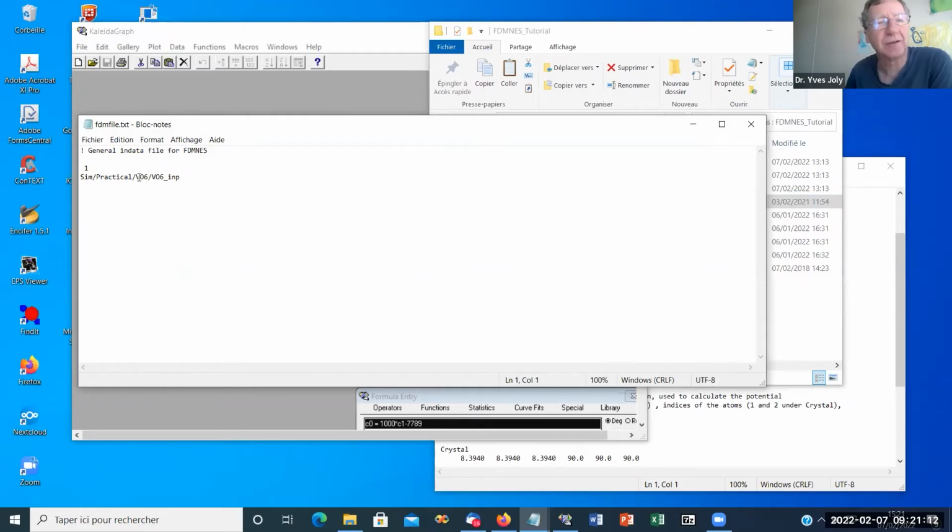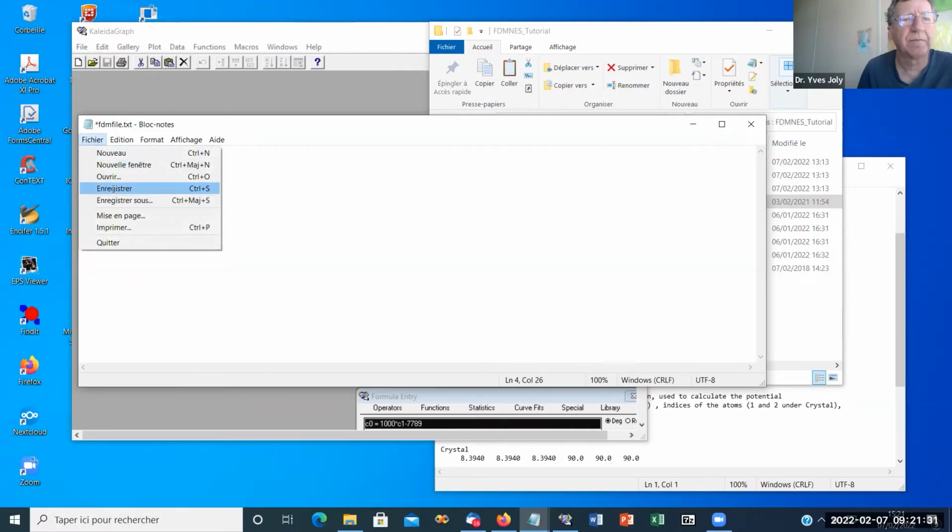We change the name of the data, the name of the directory, or the path. I save.